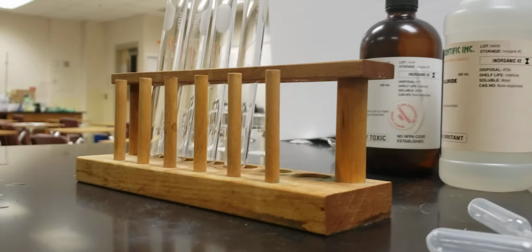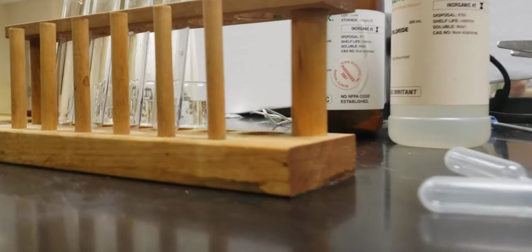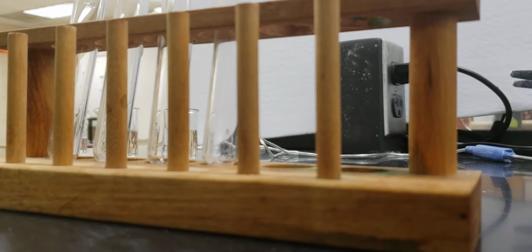And so the first thing that we're going to do is indicate for all of them which solution is going to be in each one of them.